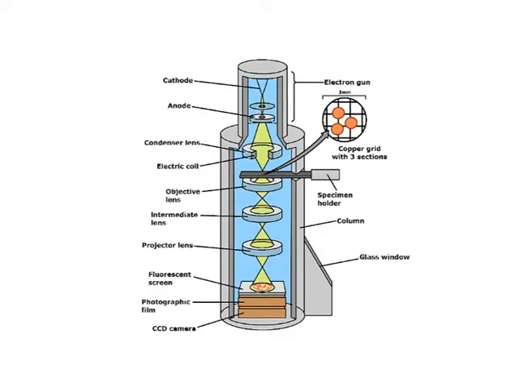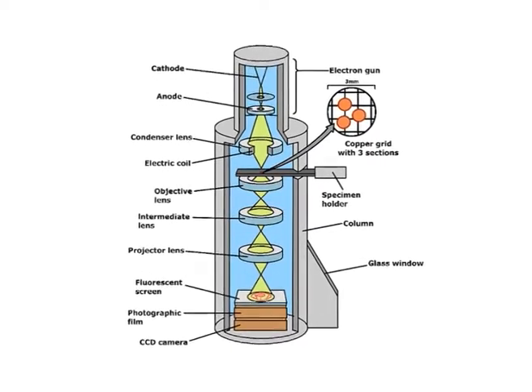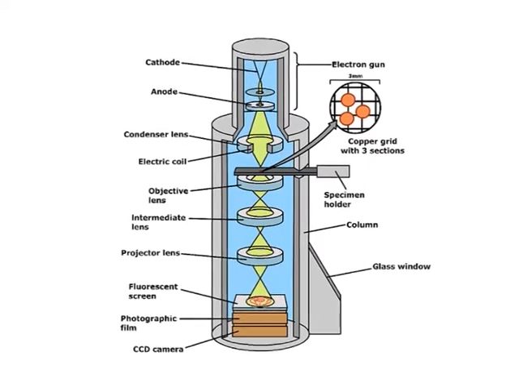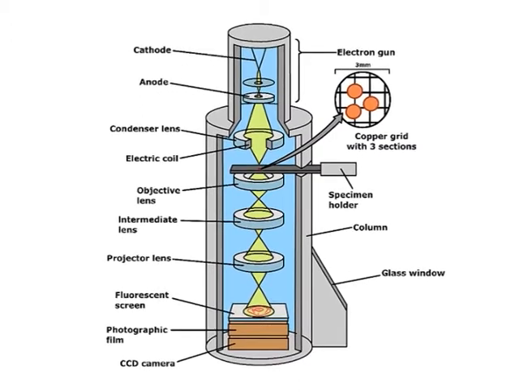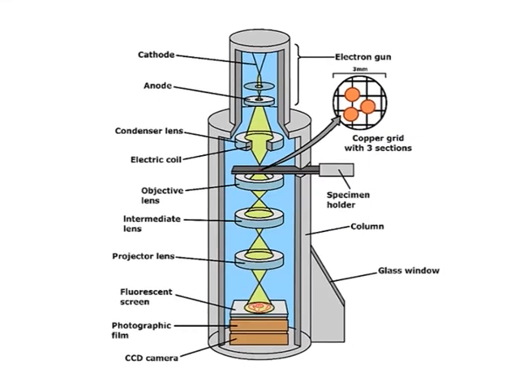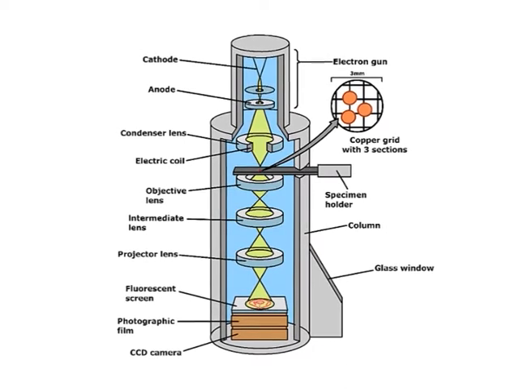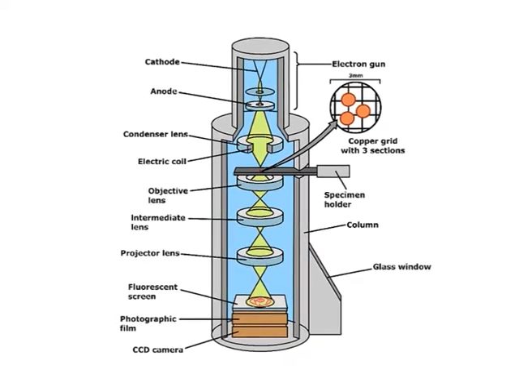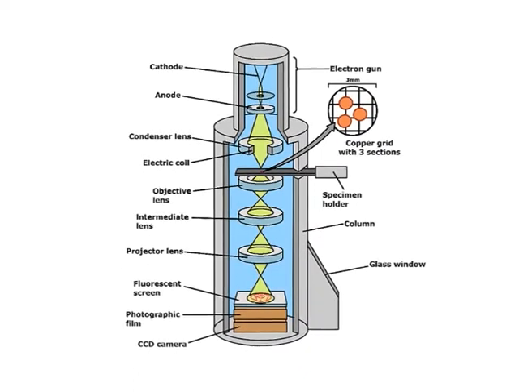Types of electron microscopy. The first one is the transmission electron microscope. The transmission electron microscope is particularly meant to study thin specimens which allow the incident electrons to traverse through after due interactions. These interactions are translated into signals which are then magnified and focused on an imaging device such as a phosphor screen or a CCD camera. The lighter areas of the image represent the thinner sections of the specimen through which a greater number of electrons were able to pass, while the darker areas reflect the dense regions of the object.